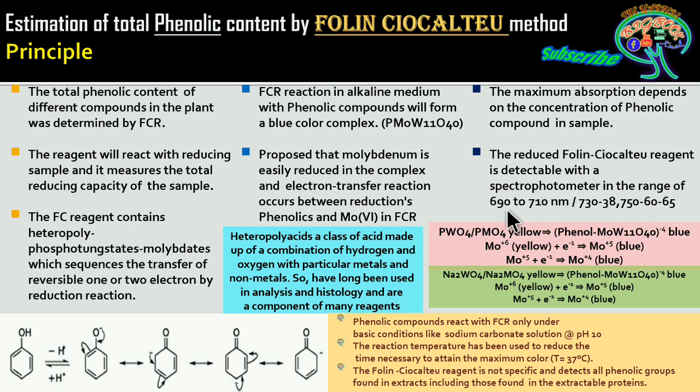These are a few which are randomly selected, frequently observed within the papers. Because these are not specific to any specific phenol, they are used randomly in this nanometer or absorption range. So these ranges of nanometers for the absorbance have been mentioned, so that further in future if you come across any other article or book, you should not get confused.